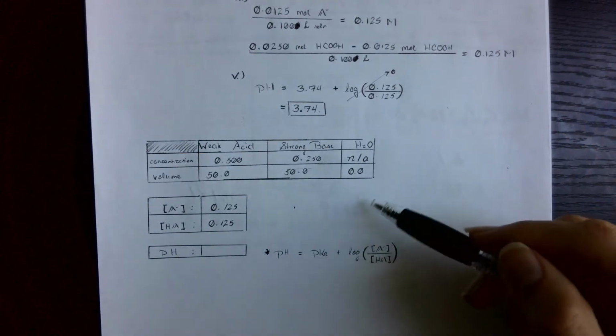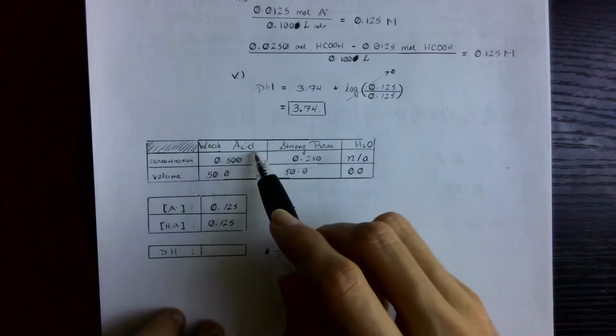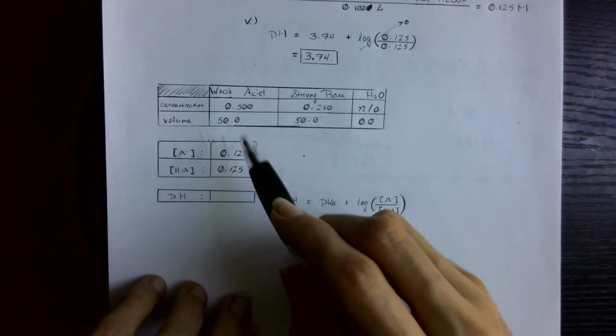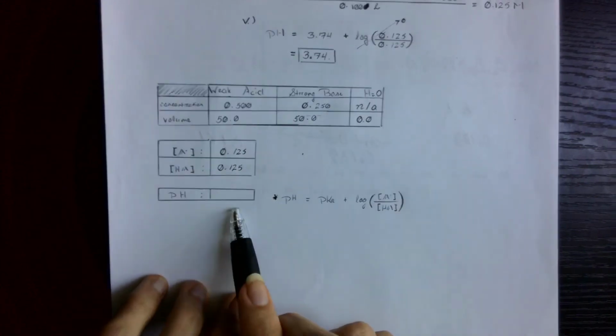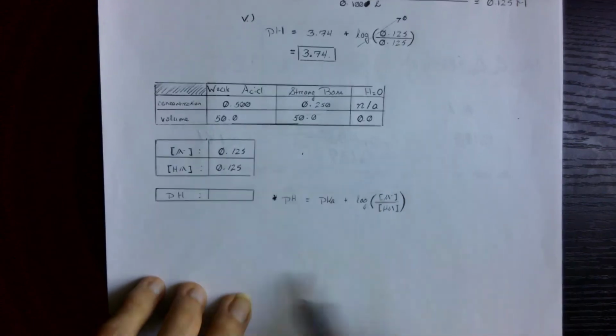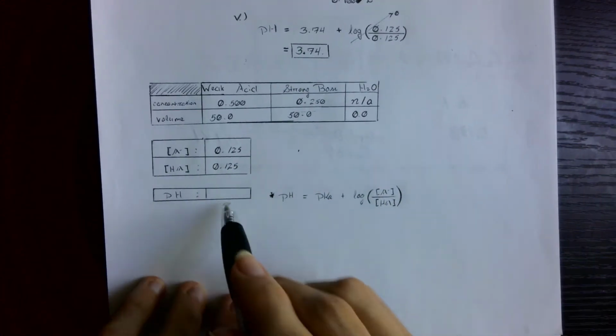You'll see for the second buffer solution, I think water is like 15 milliliters, and then for the third it's 35. That's just to keep volumes consistent. So underneath the concentration volume table for each solution, there's a place where you can record the conjugate base concentration and the weak acid concentration, and then under that there's a box for pH. I even put an asterisk with the Henderson-Hasselbalch equation next to it for every calculation. So you just plug this in here, plug this in here, take the log of that, add the pKa, and that gives you your pH value.